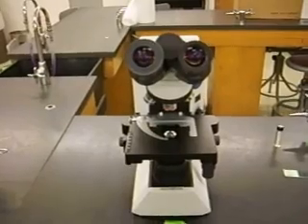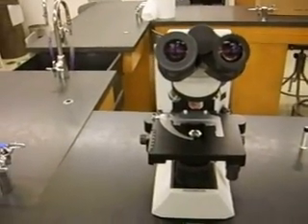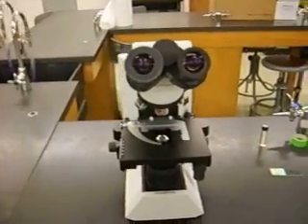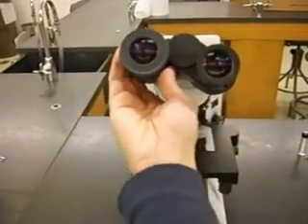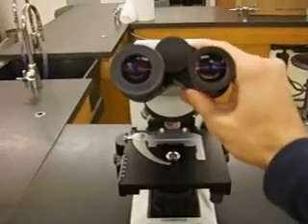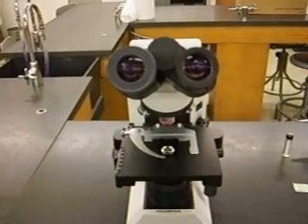Here's an overview of the most common things you're going to be manipulating on your microscope. There are a whole bunch of knobs, but we're mainly going to be using three or four of them over the course of the quarter. One thing you can manipulate are the eyepieces — you can widen them or make them more narrow to match the width of your eyes, so you can see the image with both eyes.